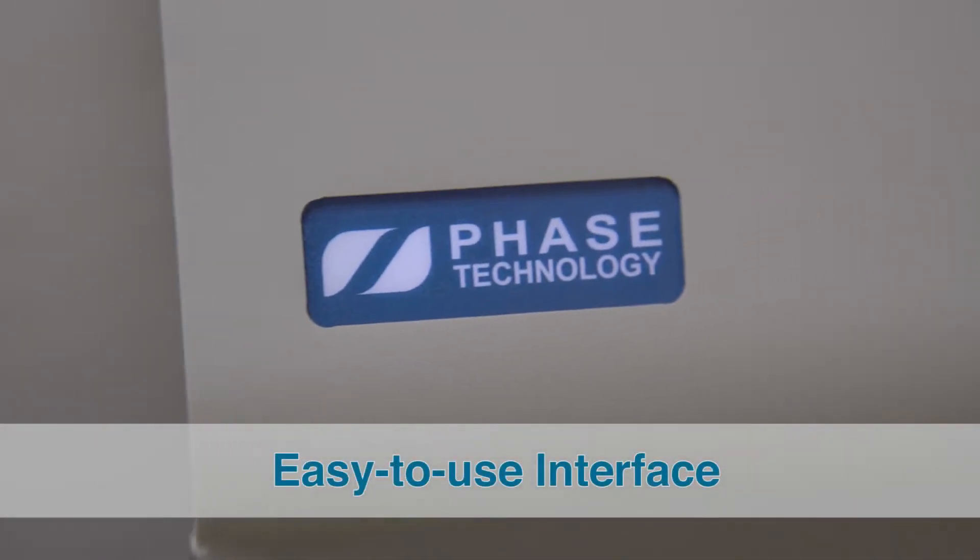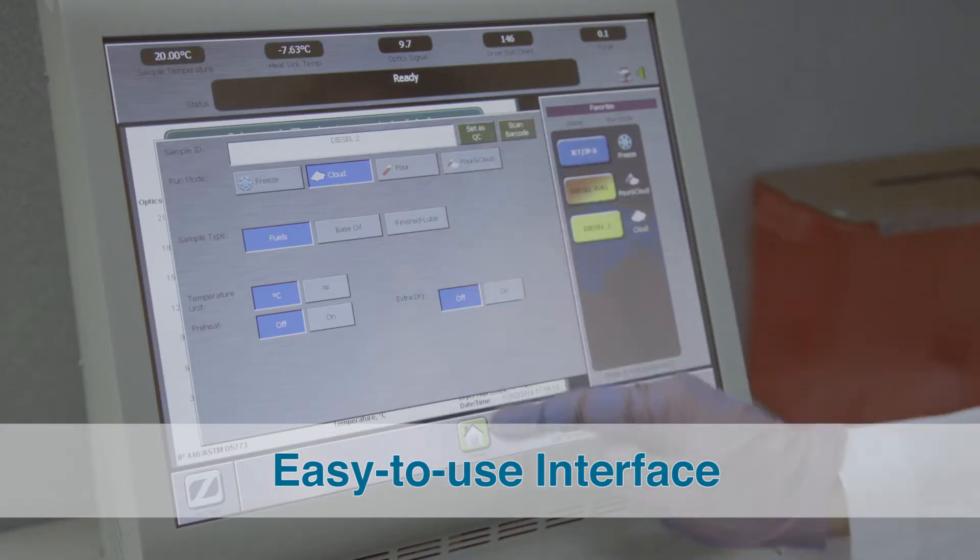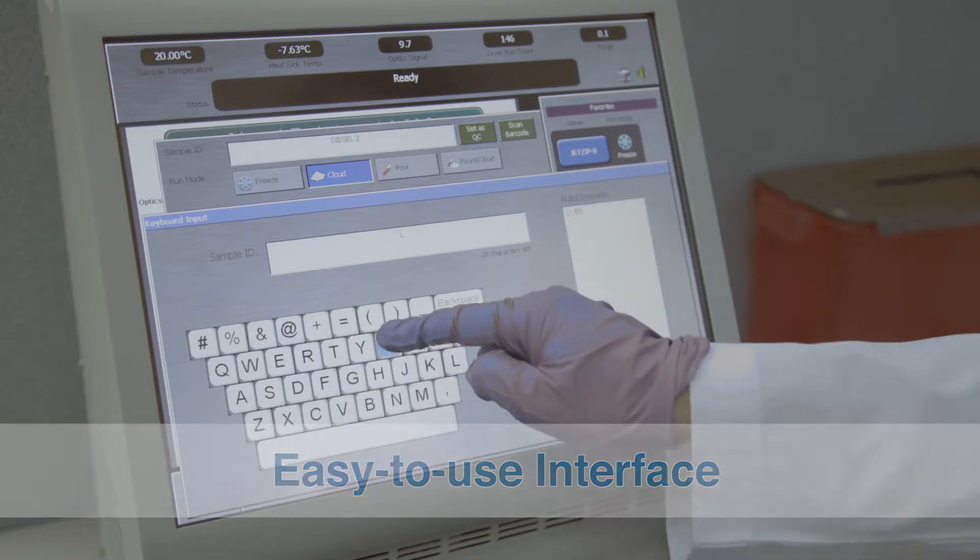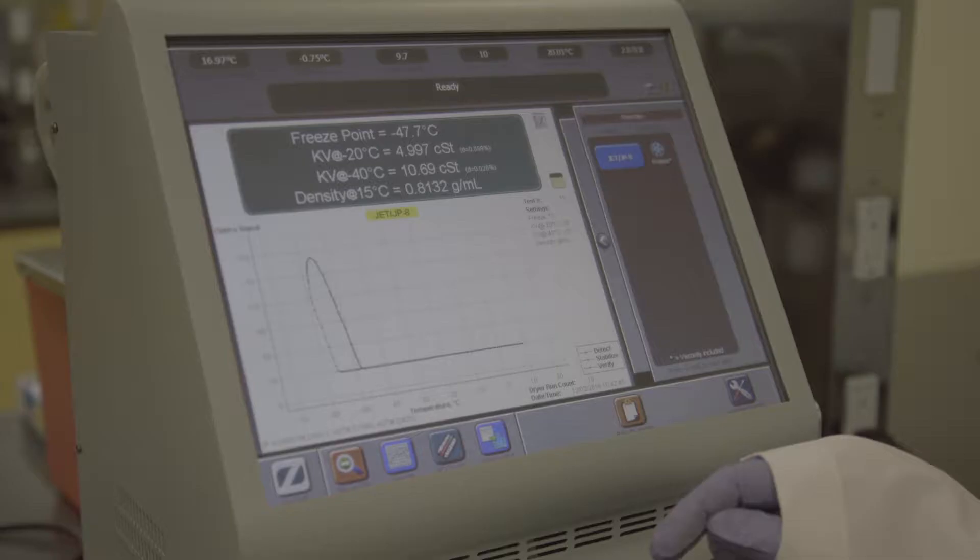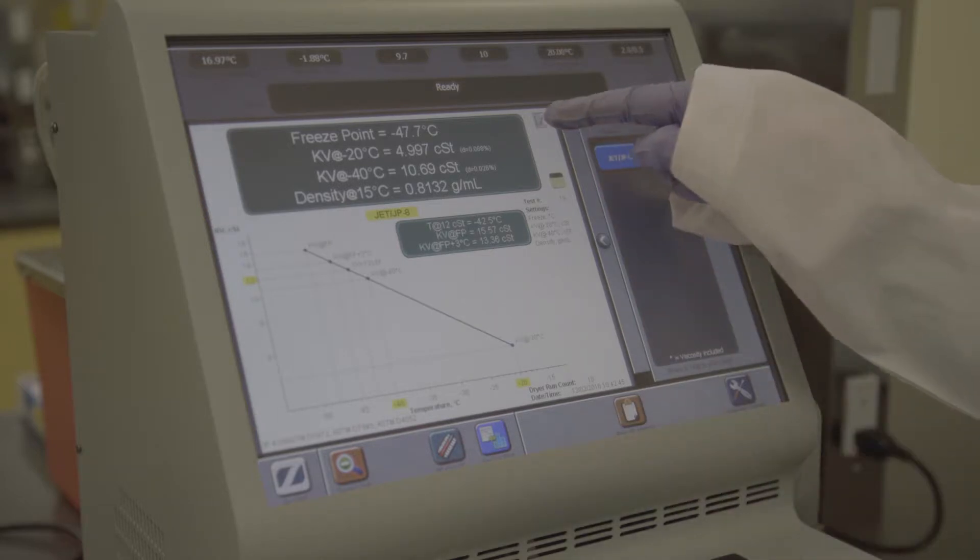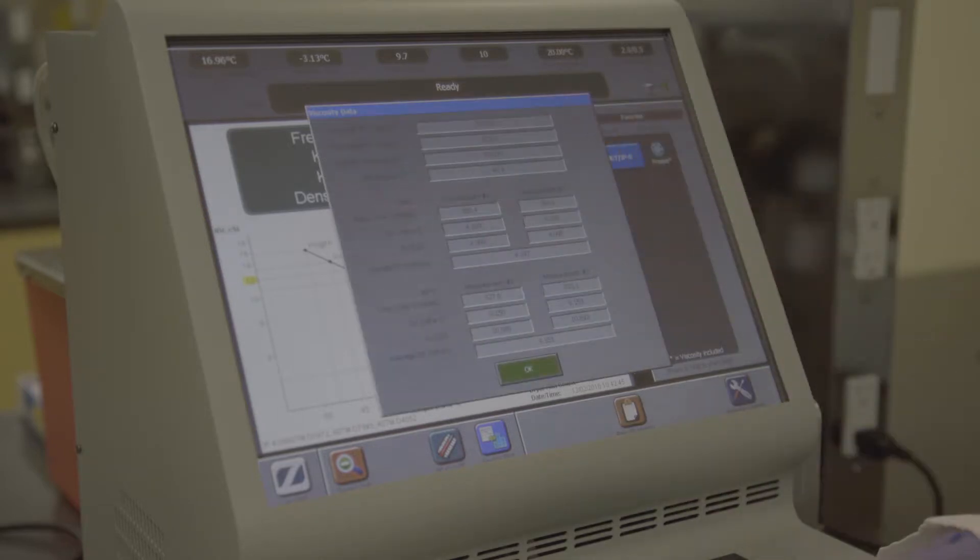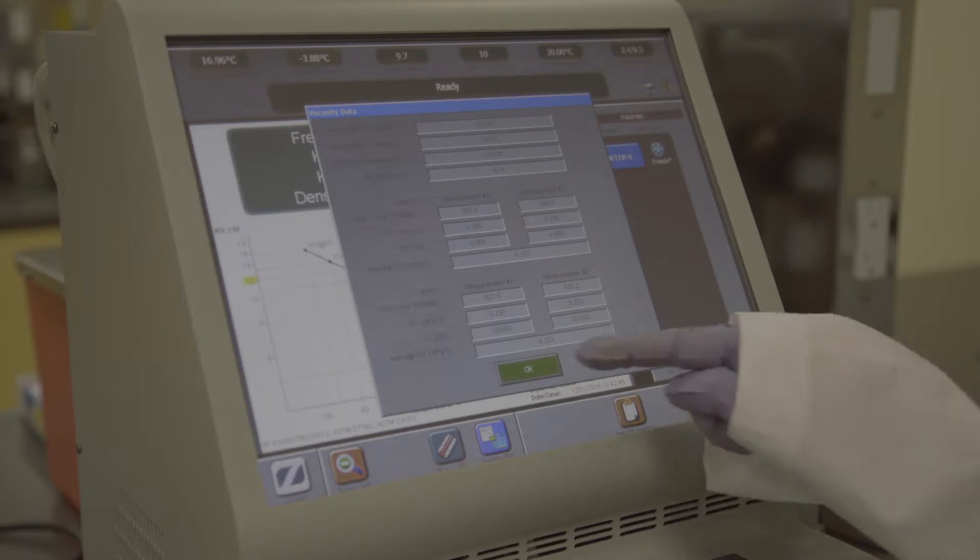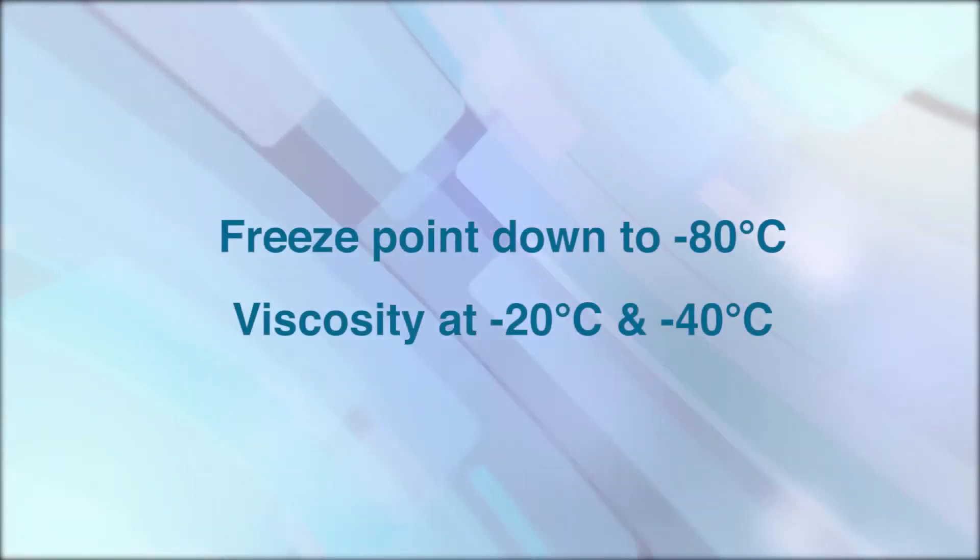Built on the 70XI platform, the JFA 70XI is intuitive and easy to understand. Its 15-inch full-color touch-sensitive high-resolution screen provides a user-friendly interface that allows you to program and select one-touch favorite tests and displays easy-to-read information. Like other 70XI instruments, the JFA 70XI does not require an external chiller.